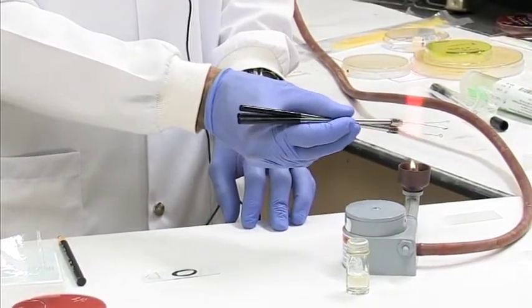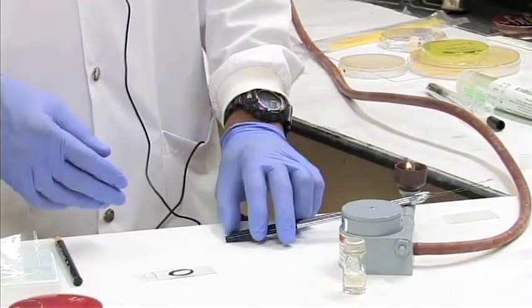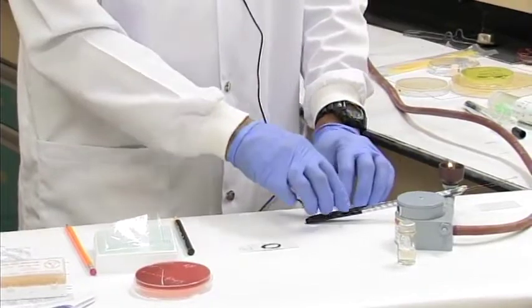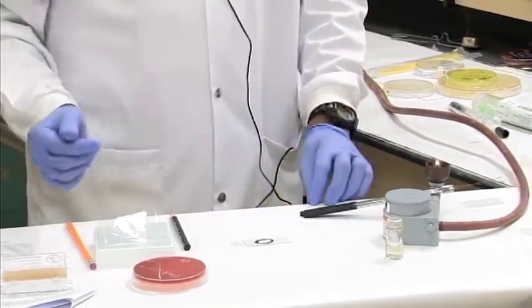Once it becomes red, you pass it across the entire length, the shaft of the loop, to make sure it's sterile. Again, when doing these demonstrations or these tests, it's not advisable to be speaking because droplets could land on your slides and so on. But of course, for demonstration purposes, I am speaking while I'm doing the test.